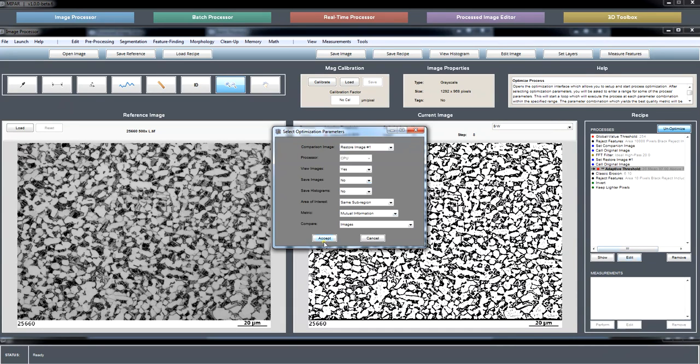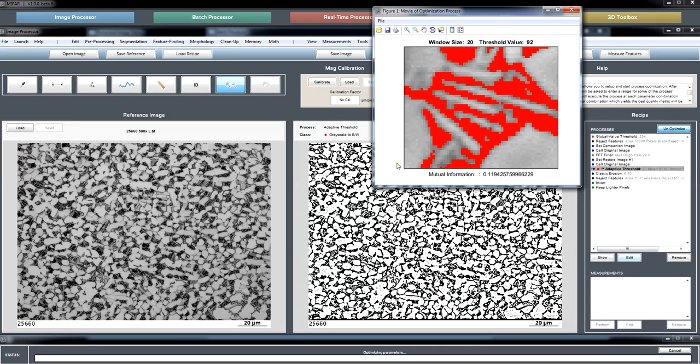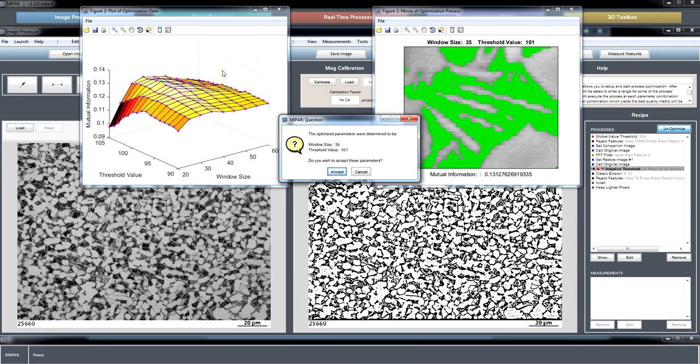So you're definitely seeing this tool run in a raw environment here. It doesn't always work exactly how you would hope. Let's go from 20 to 40 here. We'll make this a coarse step size so it doesn't take very long. Why not 60? Okay, and I think we have reached a peak here finally, up at 35.